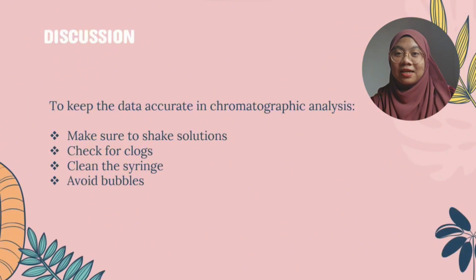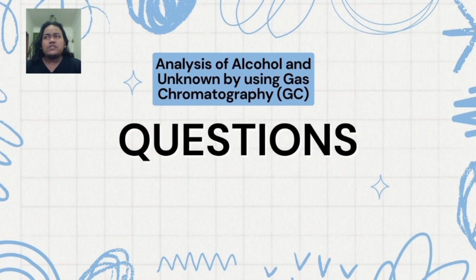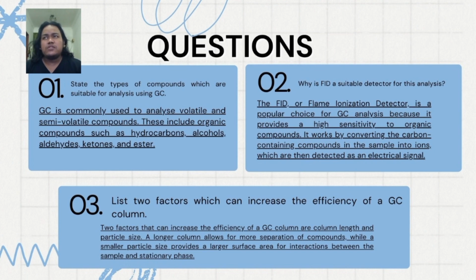To keep the data accurate in chromatographic analysis, make sure to shake the solution, check for clogs, clean the syringe, and avoid bubbles.